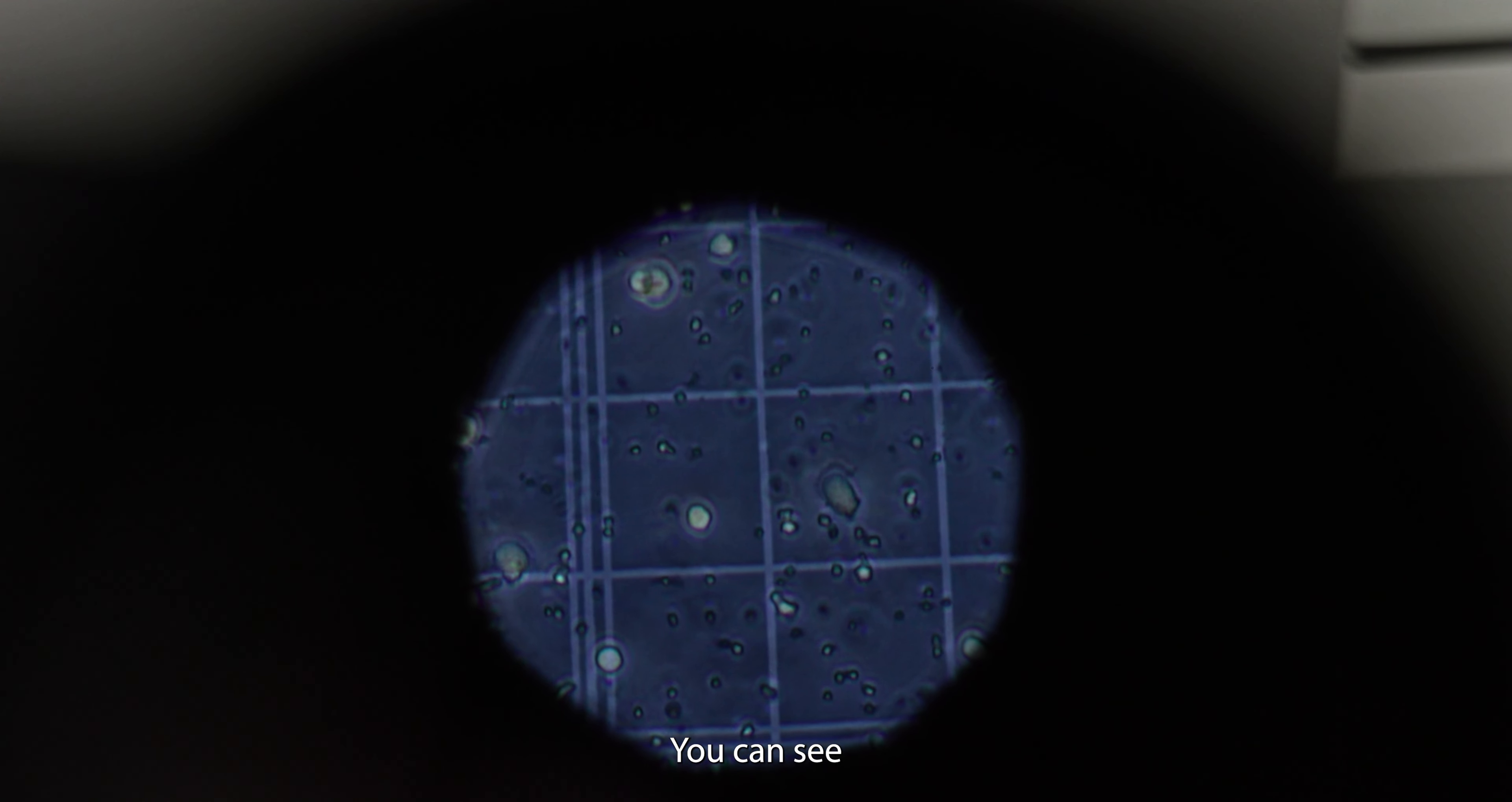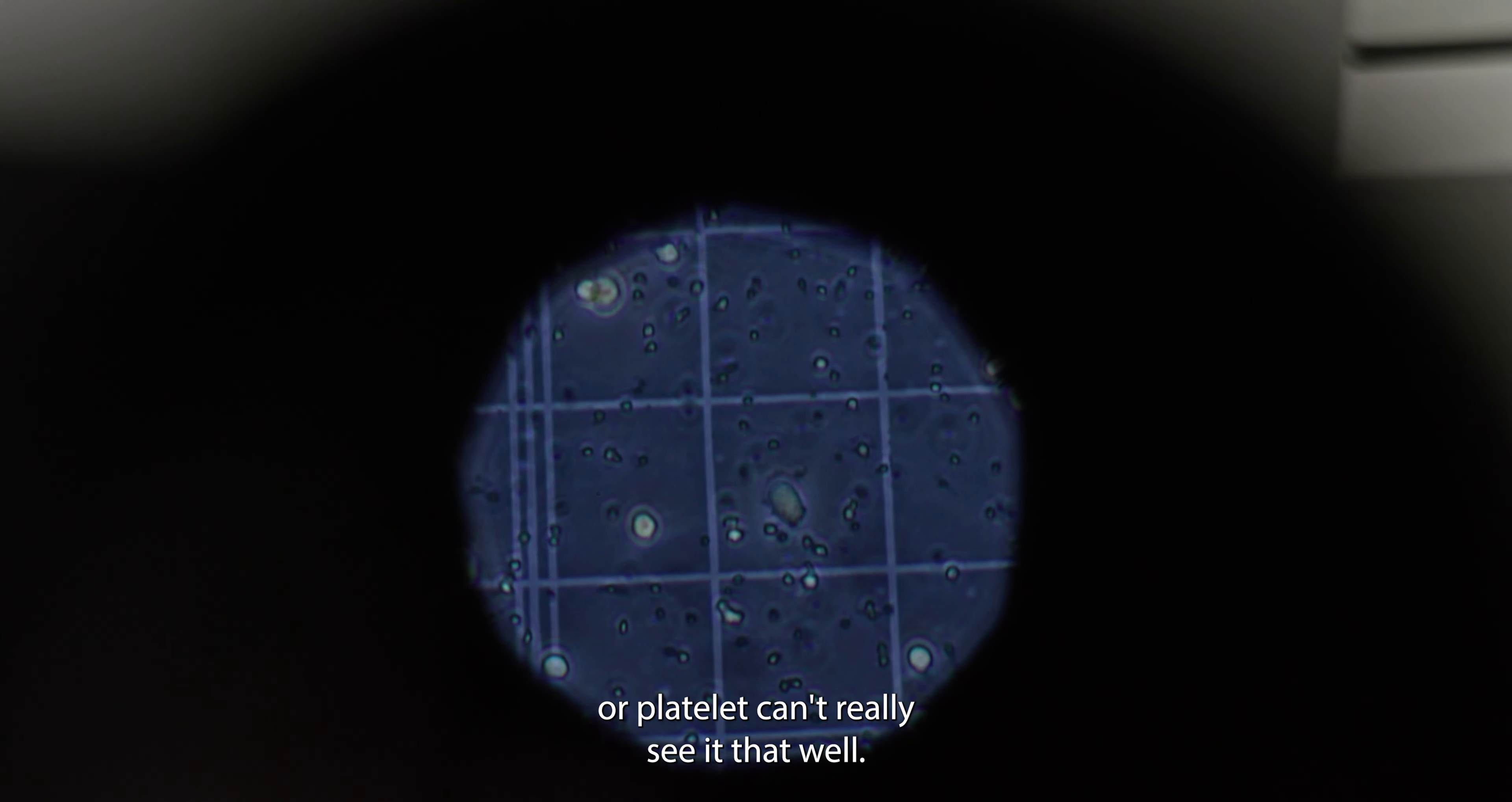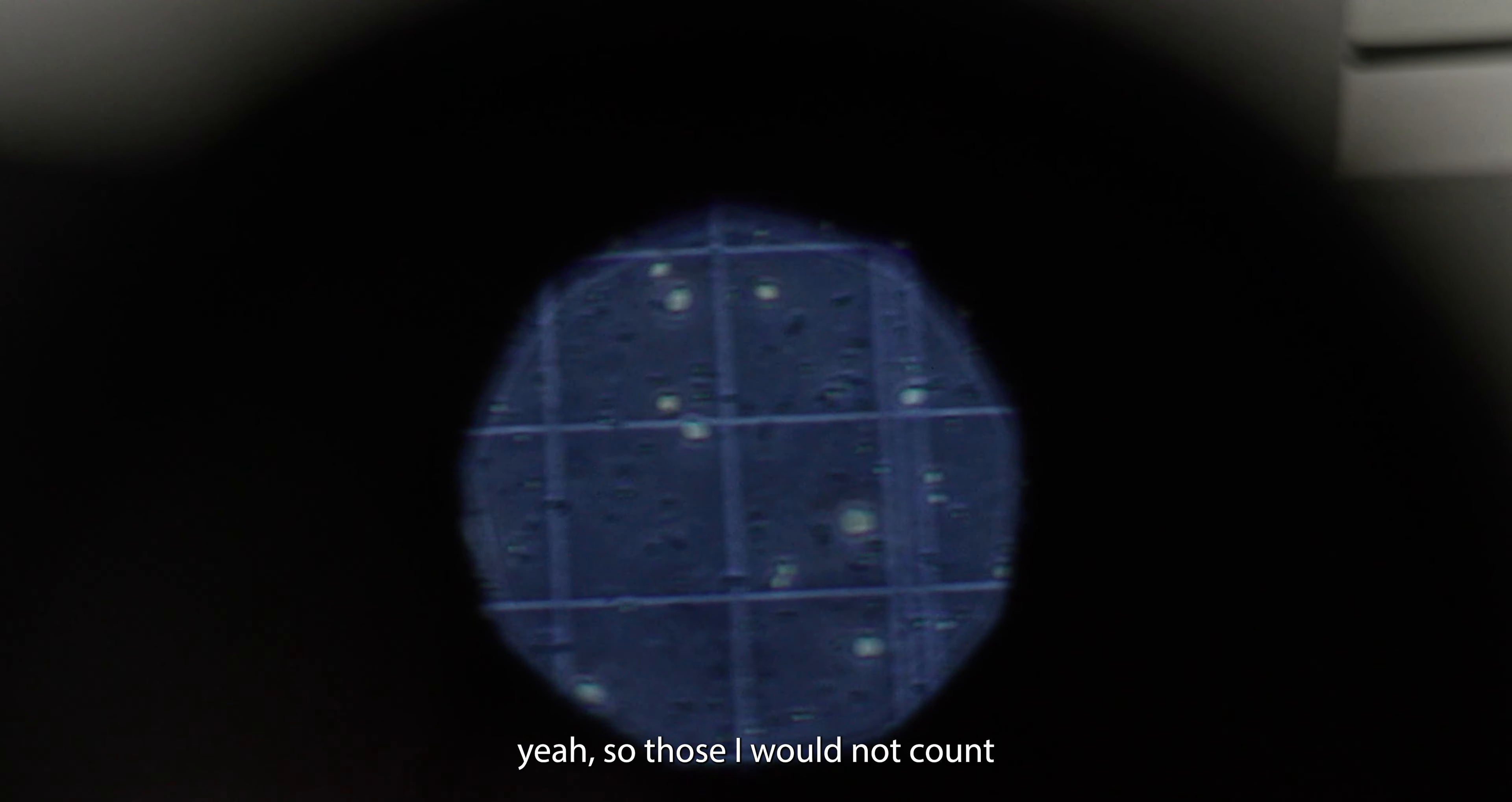You can see in the center, that one on the left, I would count. And that small smudge to the right, I would not. So one is either red blood cell or platelet. You can't really see it that well. And then the other one is probably just cell debris or fat. It's slightly dyed blue. It could be a very wonky dead cell. So those I would not count.